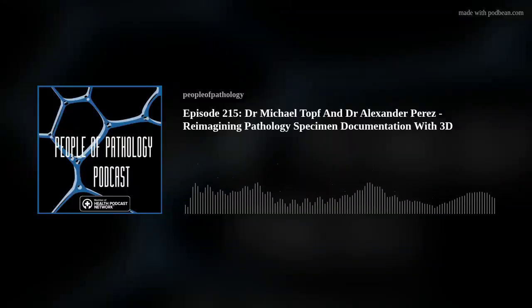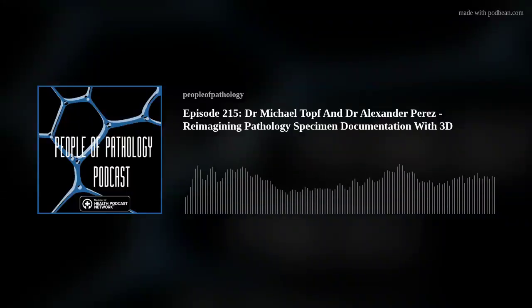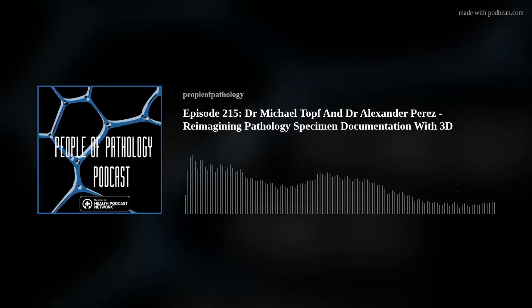And it turns out that 31% of the time, the pathologists were actually incorrectly denoting the laterality of that third stitch. So it's terrifying. These errors are occurring and they're challenging to recognize. And I think a not insignificant minority of our pathology reports are just flat out incorrect. That is terrifying. I hadn't heard of that.